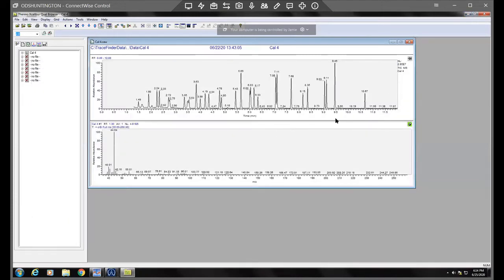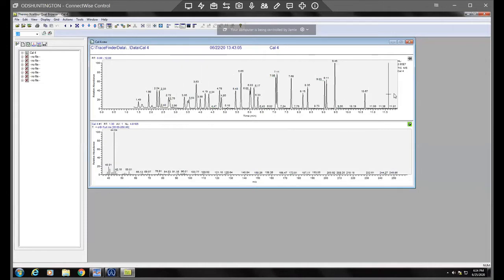So the way this works, here's your chromatogram, your TIC, and this will be your spectra down here.